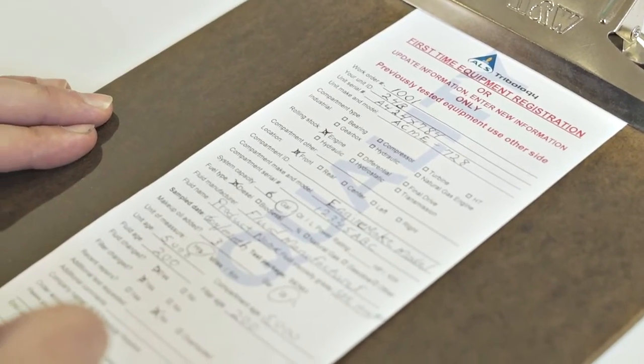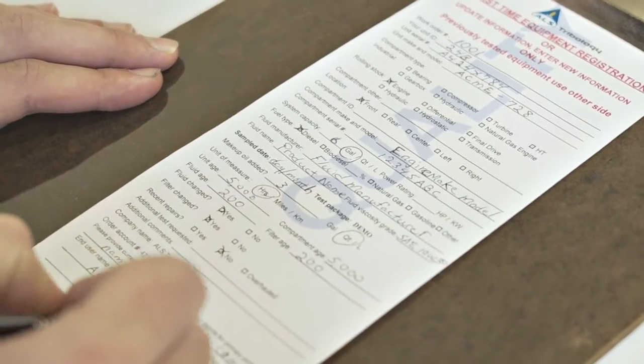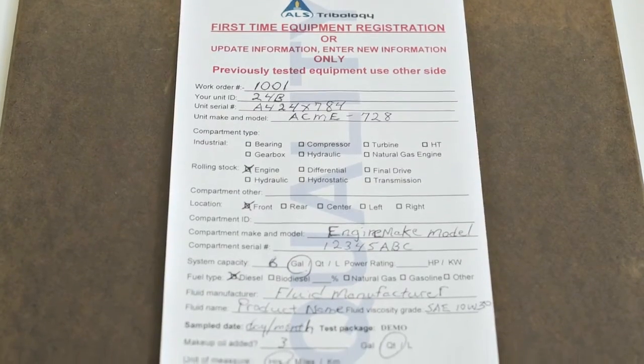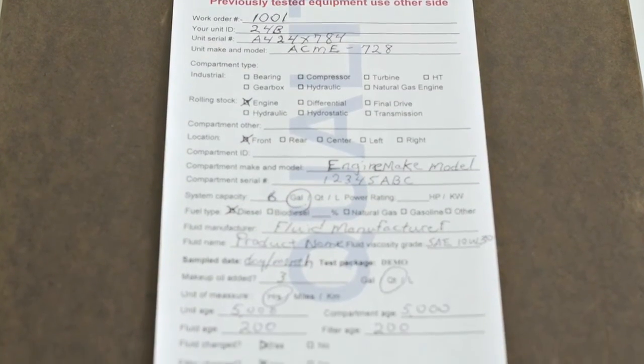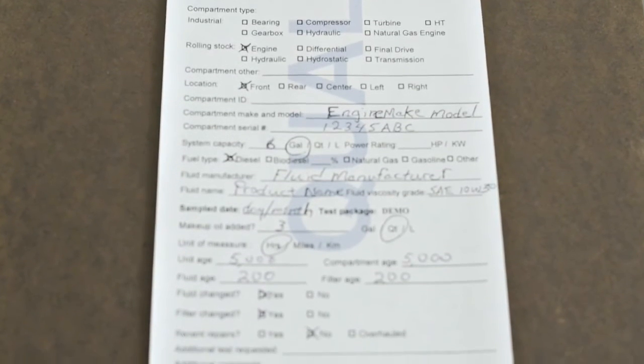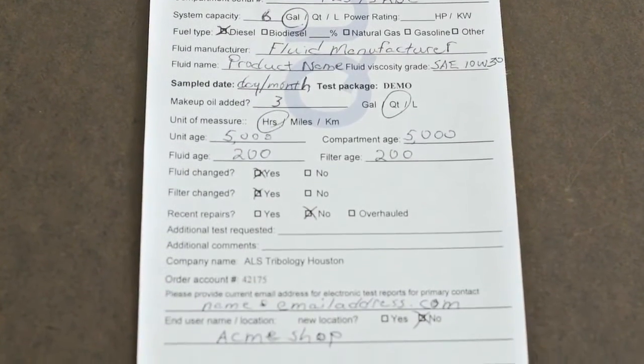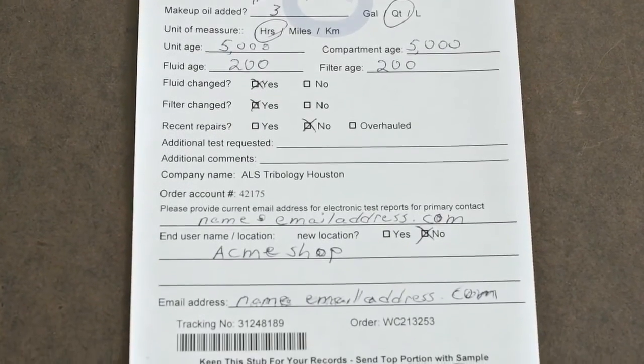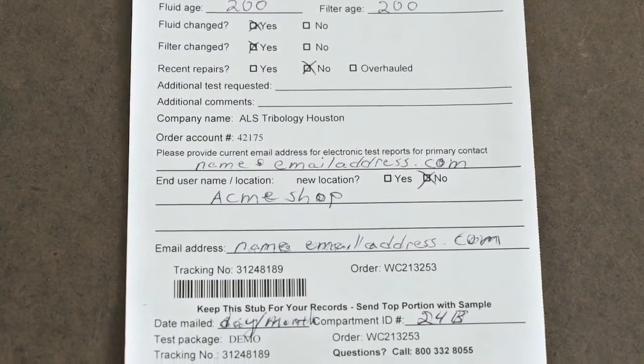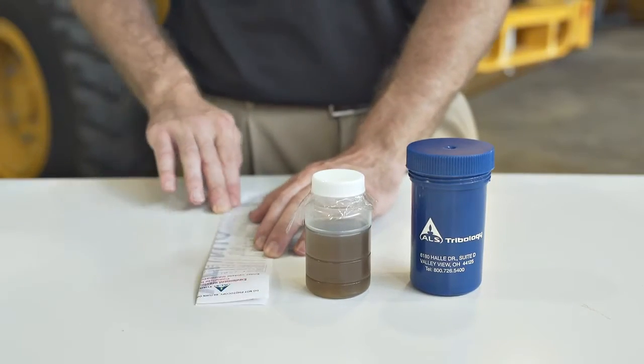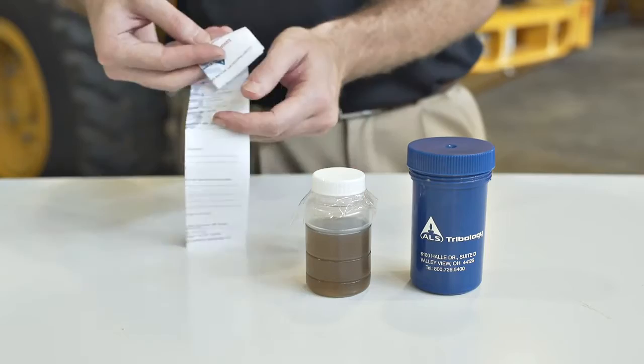If the equipment has been sampled before, it is only necessary to provide the equipment identification as it has been identified in the past or use the laboratory unique identification number UIN, age on the lubricant and equipment sampled, date the sample was taken, filter change, and any relevant notes such as maintenance or specific concerns. If there is a different fluid product being used than in the past, this needs to be indicated also.